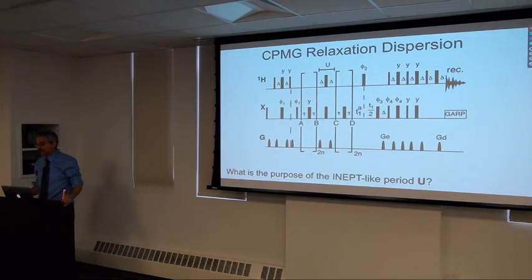That's been done on certainly up to 50 kilodaltons. But then, much larger, one has to switch over and do methyl experiments, in which one takes advantage of the fact that there's a methyl TROSY effect and the methyl lines are very narrow. So at least up to 50 kilodaltons, these experiments will work on N15 if you switch over to the TROSY versions. But then, large things, it's really the methyl group experiments that Lewis's group has pioneered.